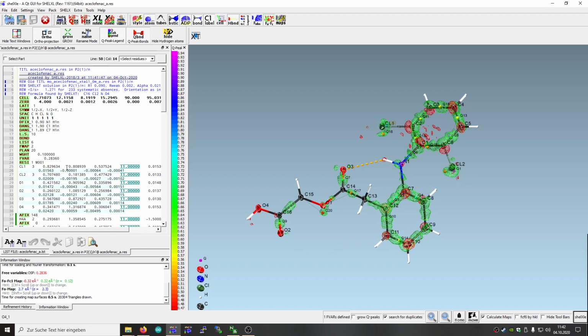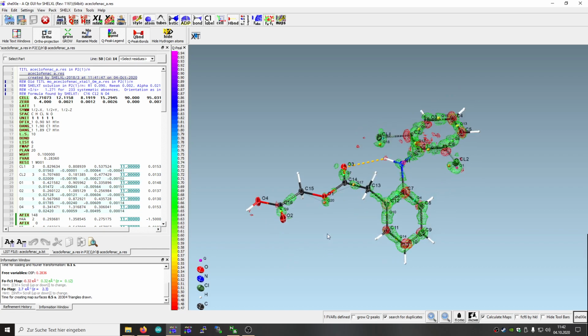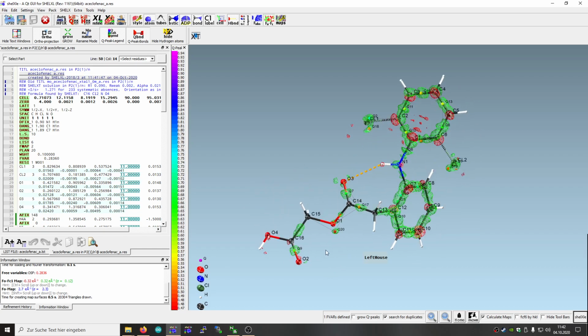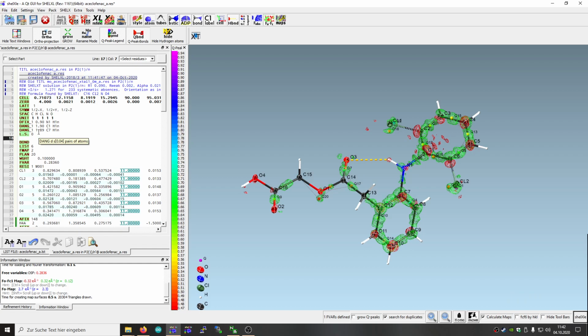Yeah, so if we are not sure that all these hydrogen atoms are placed correctly, there's a little trick. So I just changed the least squares to 0 cycles and use the OMIT $H command. This will preserve the structure as it is, but just computes the structure factors, now excluding hydrogen atoms.